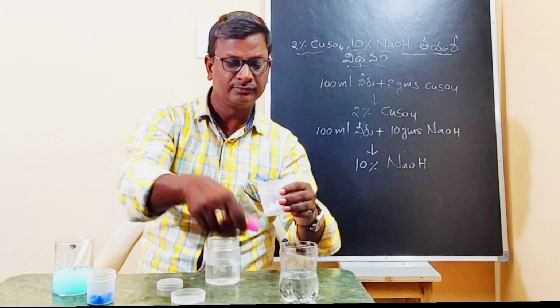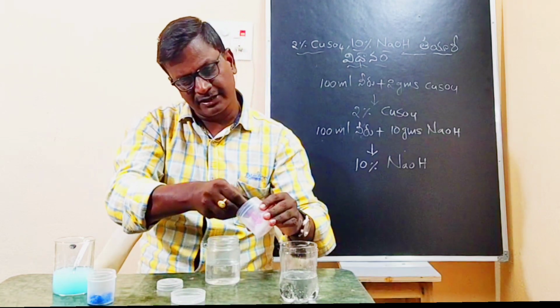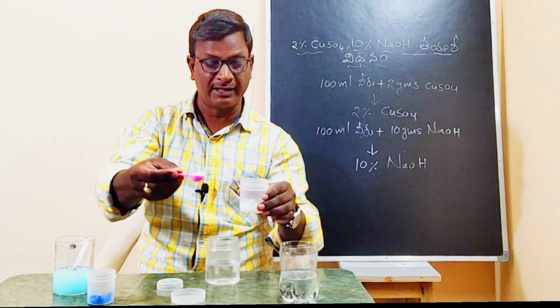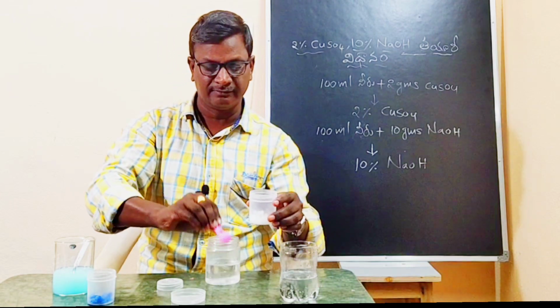I am adding approximately 10 pellets. 10 grams means 10 sodium hydroxide pellets are dissolving.